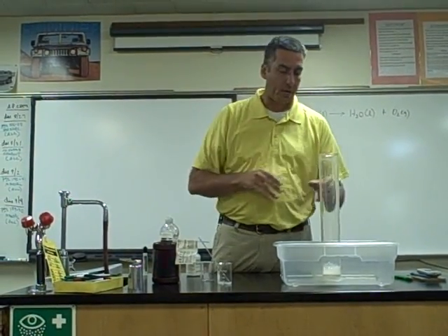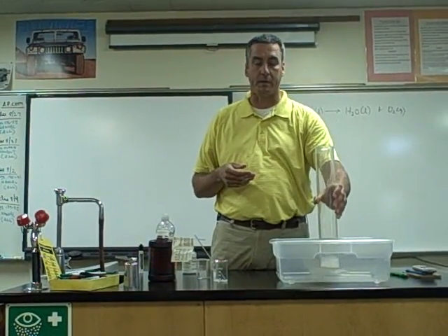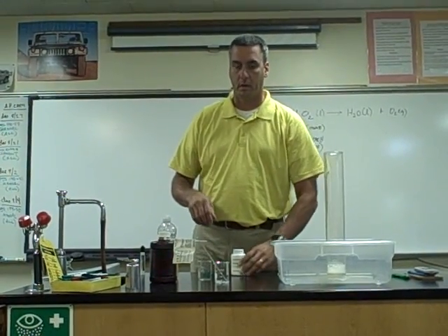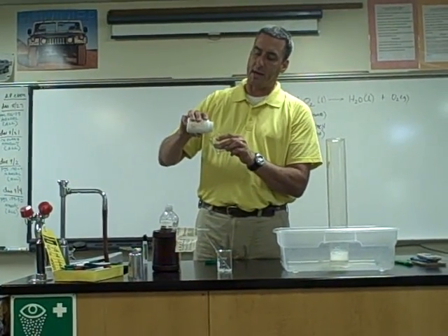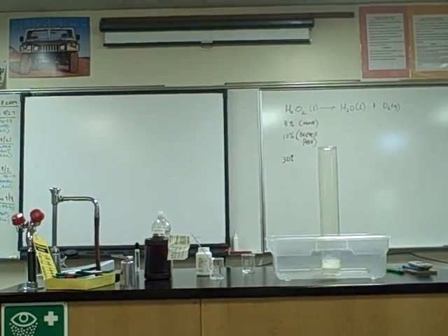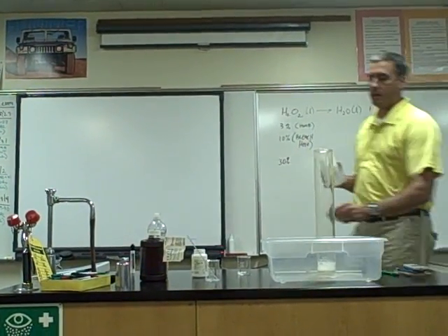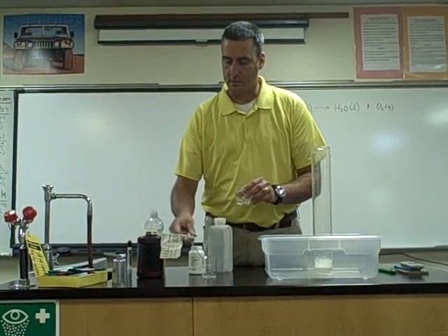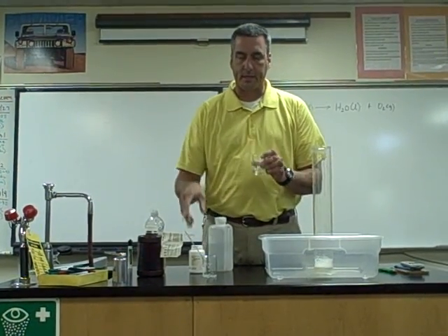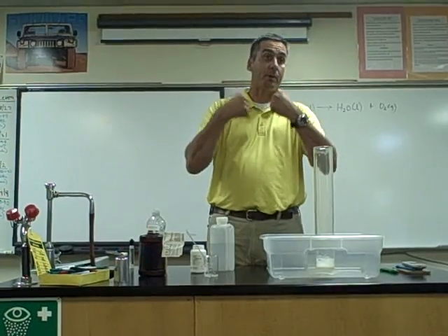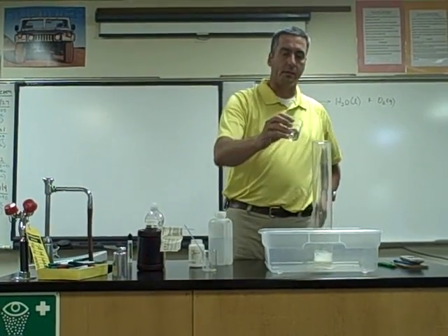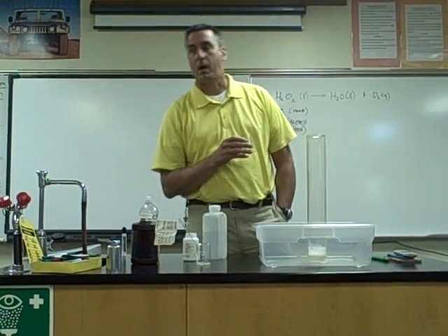How could I make them collide with enough energy? I could heat it up — that would increase the rate and it would decompose faster, but I don't want to do that. I want to do it at room temperature. So my second option is a catalyst. I have a little bit of potassium iodide, and the iodide ion acts as a catalyst. I'm going to make this a homogeneous catalyst — I'll dissolve the KI in distilled water, stir it up, get it into solution. Adding a catalyst means that when they collide, they don't have to collide with as much energy to form an effective collision — they have a lower activation energy.